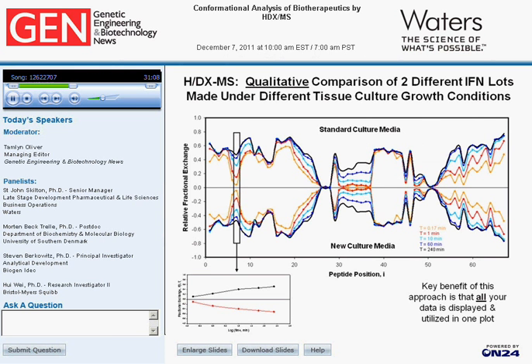So by making this plot, we get an overall general picture of what's going on with various parts of the molecule in terms of the exchange, plus we have an ability to make this relative comparison between the experimental and reference peptides. And in addition, all the data that we've acquired during this experiment is actually presented in this plot. And this is very helpful to take advantage of all the data that's acquired. Okay, next slide.